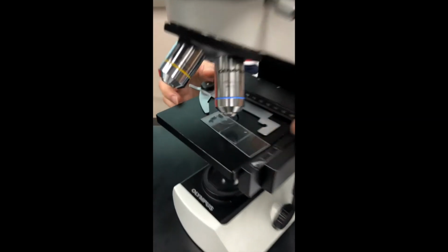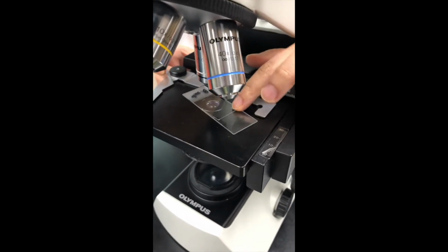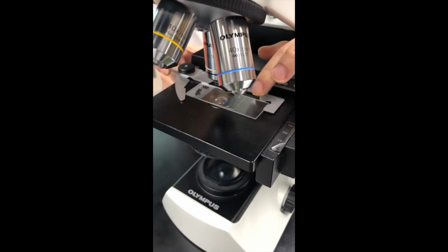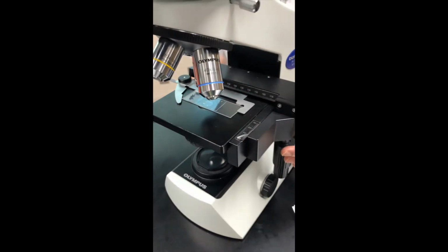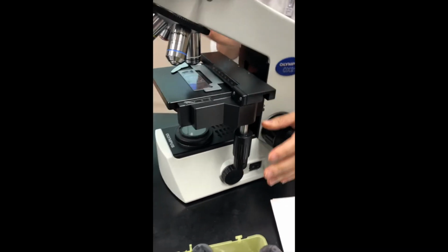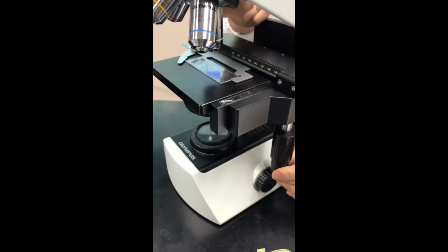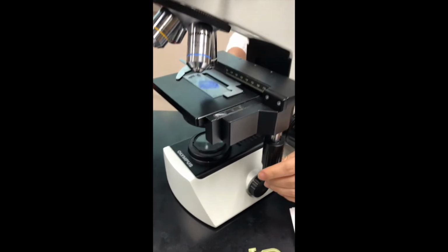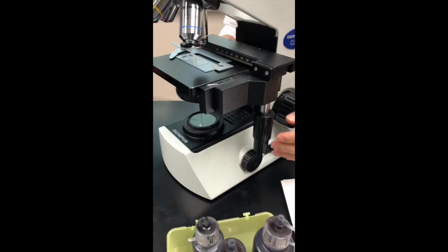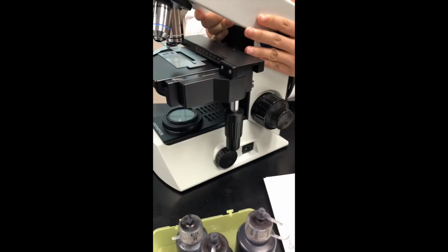And here is our slide retainer. You carefully place your slide like this here. And then you could use the mechanical stage retaining screw to rotate it like this to the perfect position.